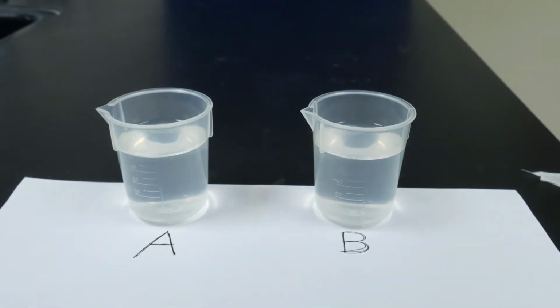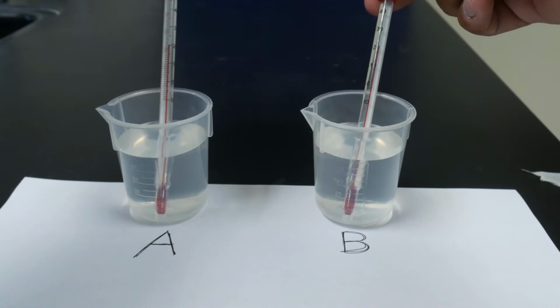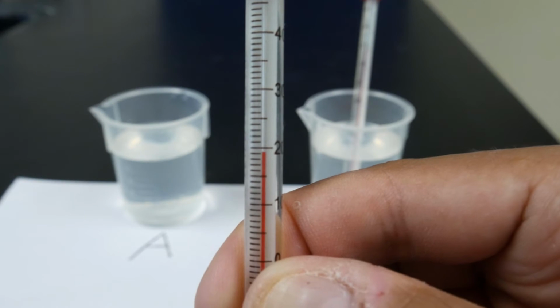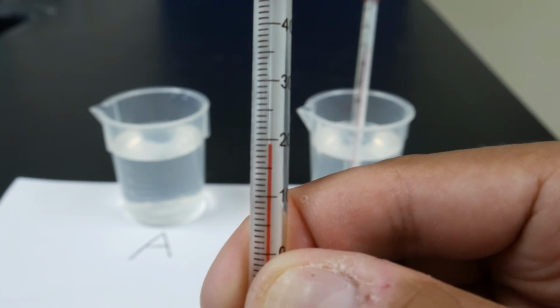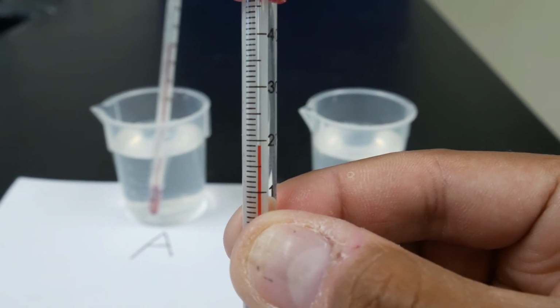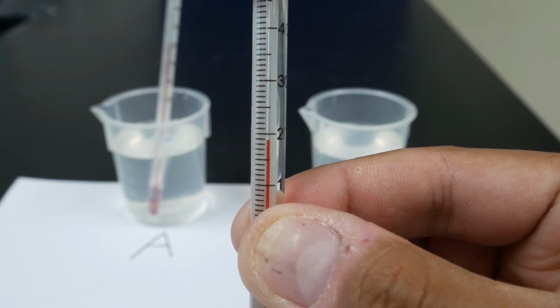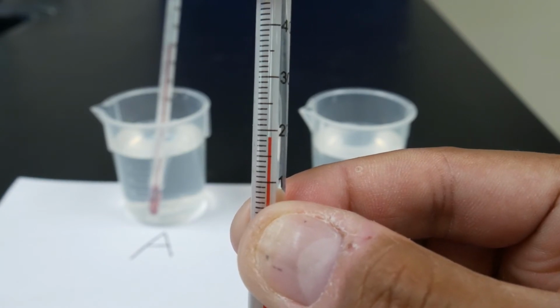We're going to put a thermometer in each one, and we're going to record what the temperature is before we do anything else. All right, so before we start, it looks like the temperature for beaker A is about maybe 19 or 20 degrees Celsius. We'll say maybe 19 or 19.5. Looking at the thermometer for beaker B, it looks at about the same place, so we'll say about 19 degrees Celsius.